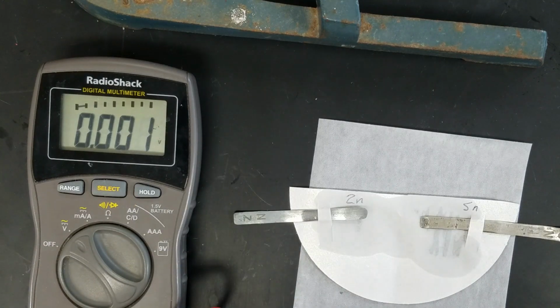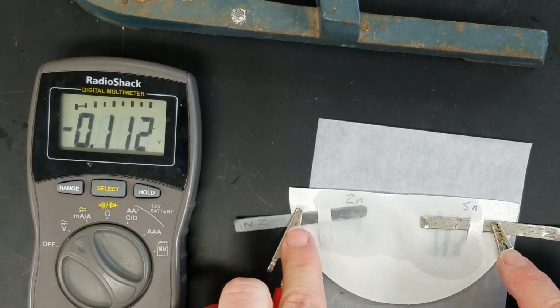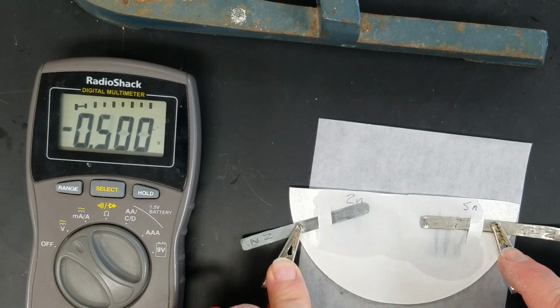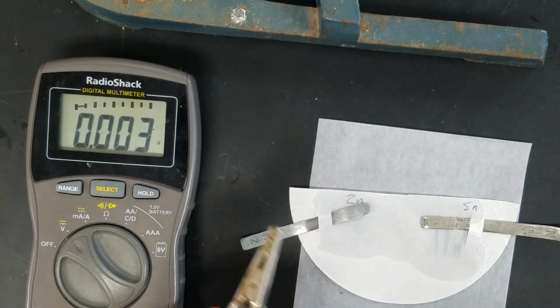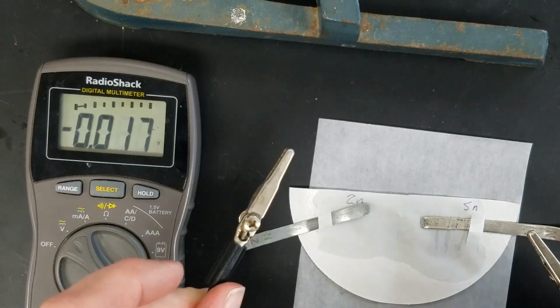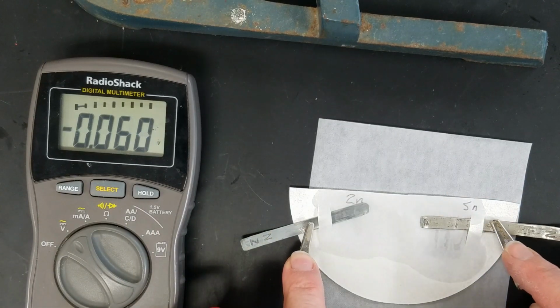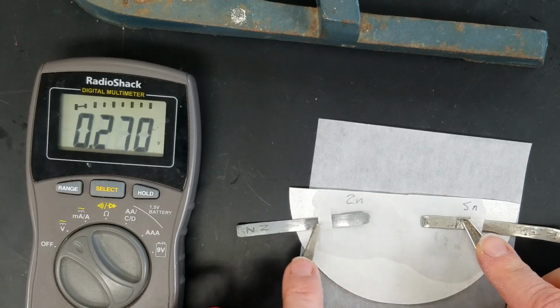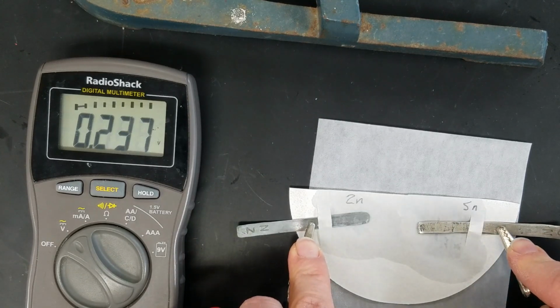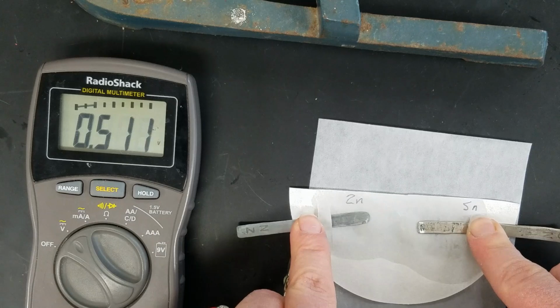Start with the red lead on the zinc and see what we end up with. Oh, we have a negative value, so we're going to swap the leads around: black on the zinc, red on the tin. There we go, that's better. And you want to record your voltage.